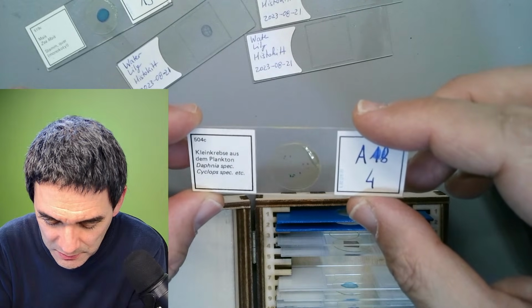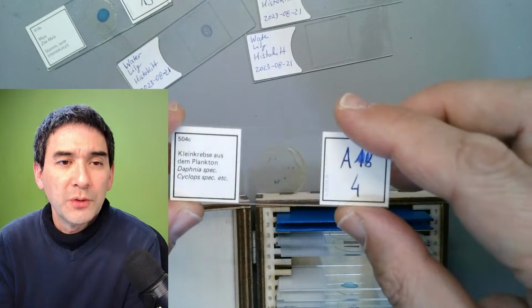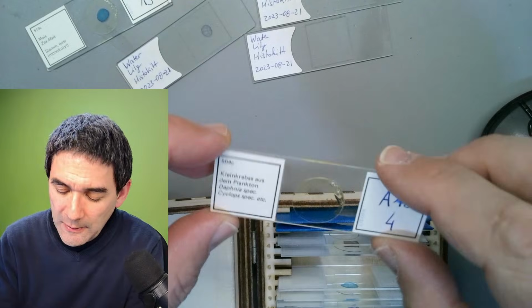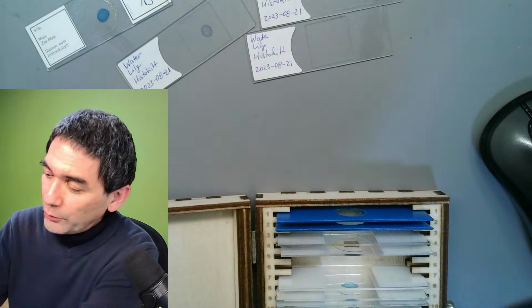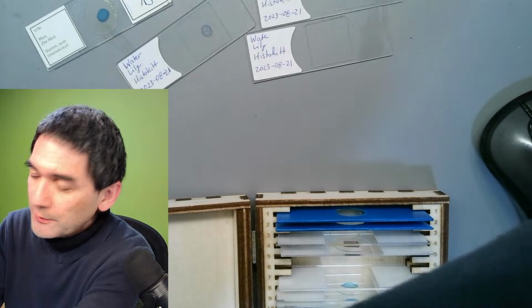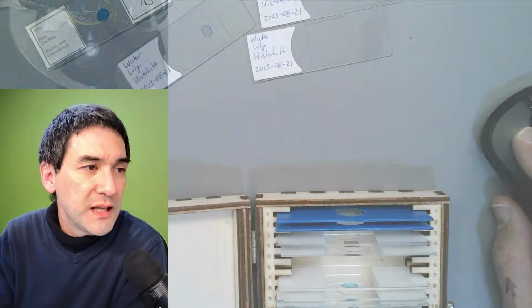Oh, okay, it's plankton. Daphnia. Oh, Cyclops and Daphnia. No, that's fine. These are basically stained specimens of water fleas. One of them is red, the other one is green stained.